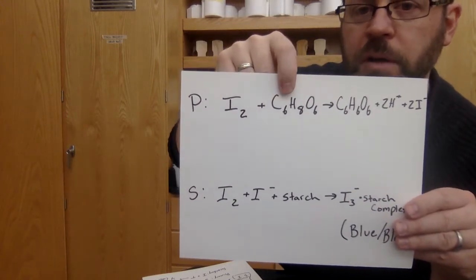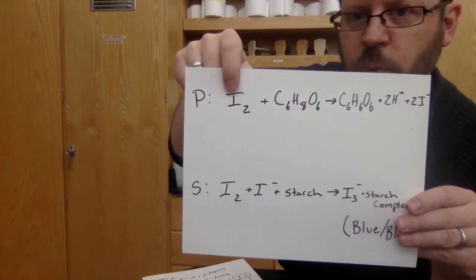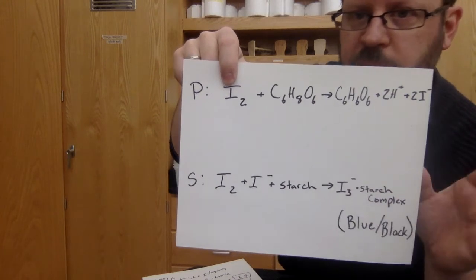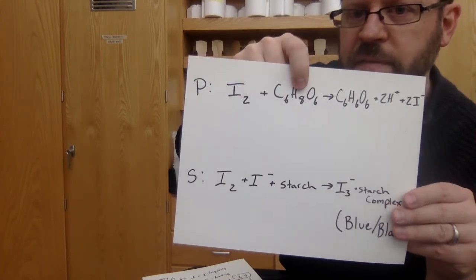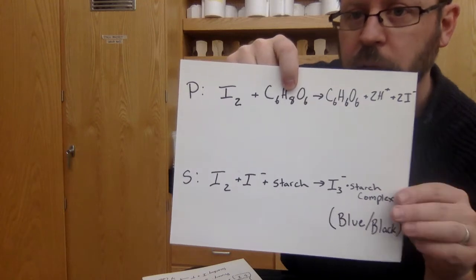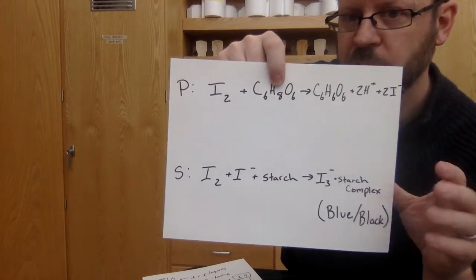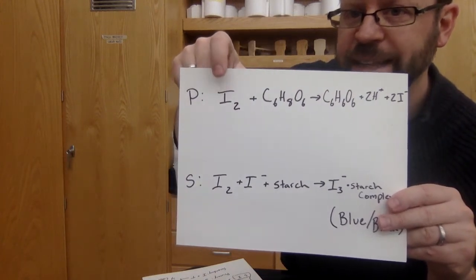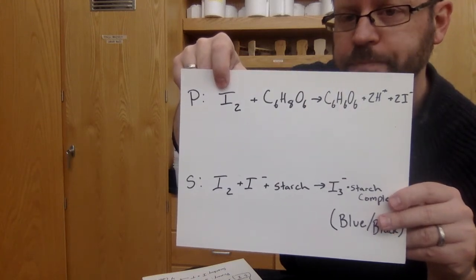But you will need the molar mass of this so that you can figure out how many moles of this is in 25 anticipated milliliters of this approximately known concentration. So that's going to be the number of moles of that I would want. And then you got to figure out how much powder you're adding effectively so that you can achieve that amount, so that you can eventually find the actual concentration of this. And hopefully it's close to what you think it is.